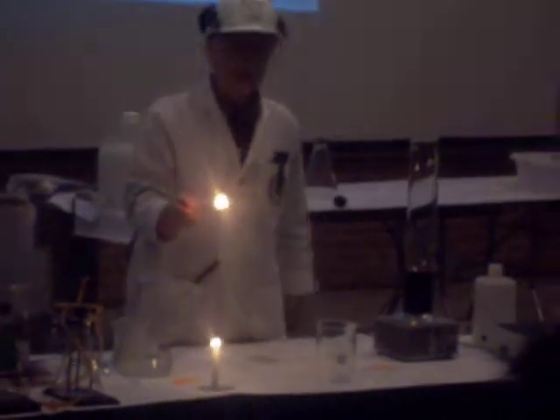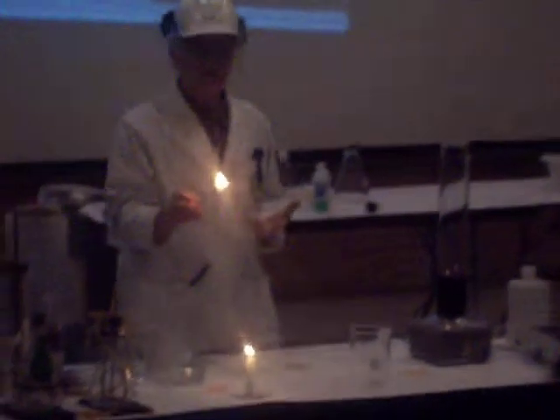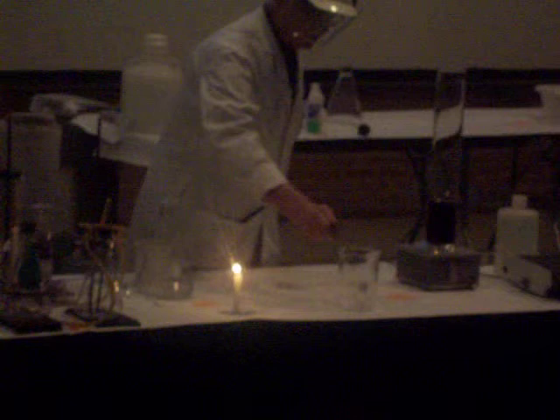with the dry ice. Now, carbon dioxide gas is colorless. It's also heavier than air, but we can't see it. So we'll do a chemical test to find out just where the carbon dioxide is in that beaker. It's apparently right at the very top of the beaker. It's got it completely filled up, even though you can't see it.